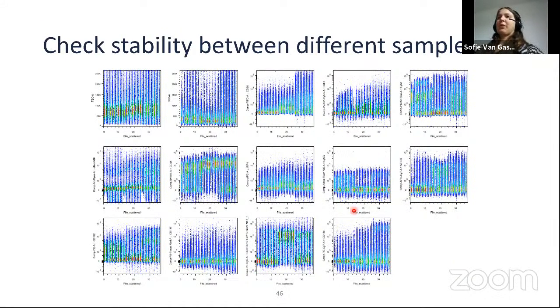Maybe in a certain group of samples, indeed, there is less signal of a certain marker. However, if you notice this and the way the samples are ordered is just by measurement day, and this is day 1, day 2, day 3, then it doesn't make sense. Then it's just technical artifacts, and that's really an issue you should try to avoid.